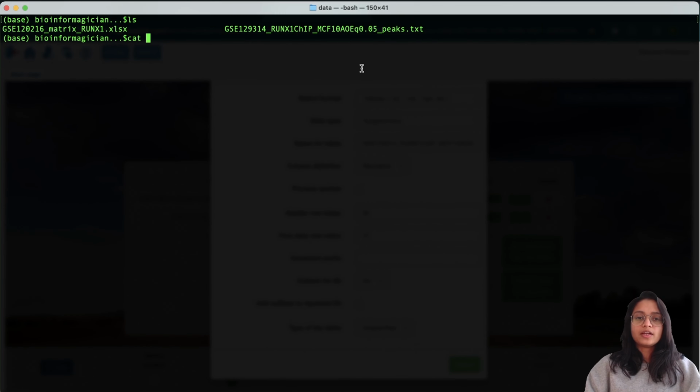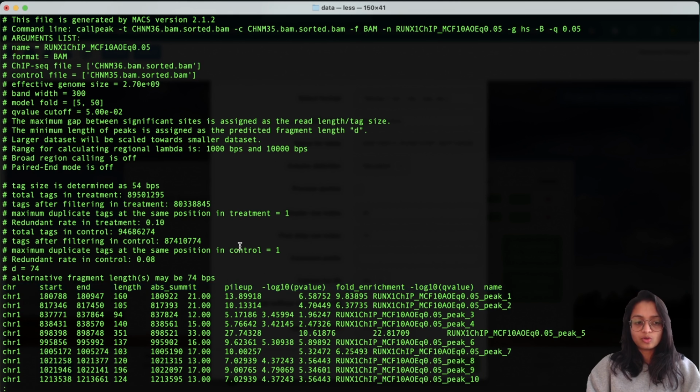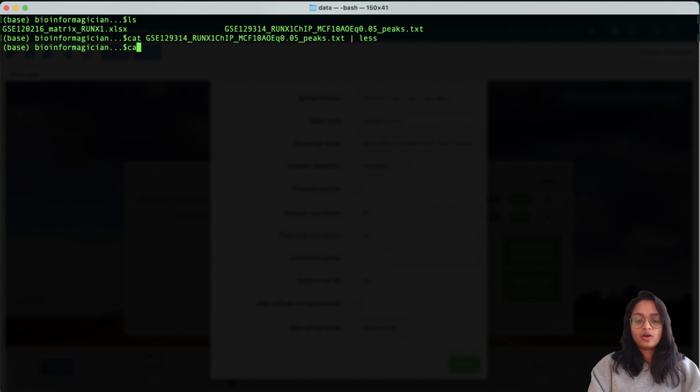So when you look at your ChIP-Seq file here, there are essentially these rows that I want the tool to ignore. So I basically want to know what line is this row, which is the header row. So there's a very quick way to find that out. So basically the header row starts at row 30. So that's how I know my header row is at row 30.